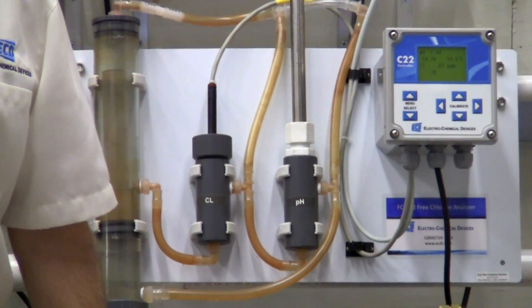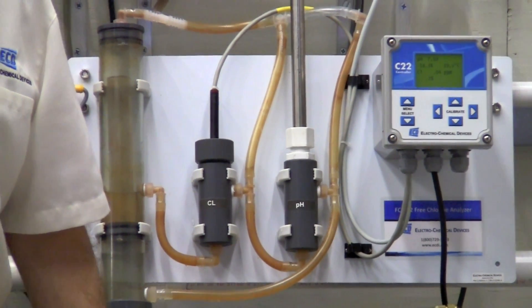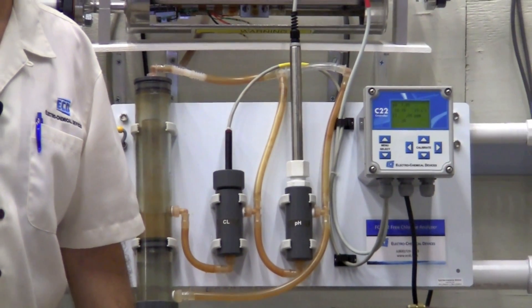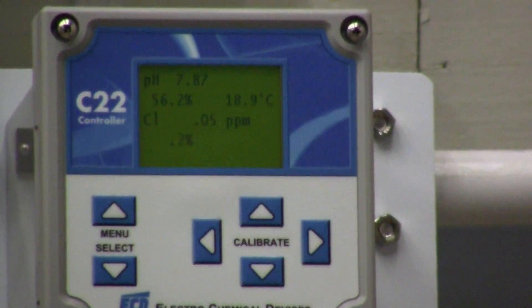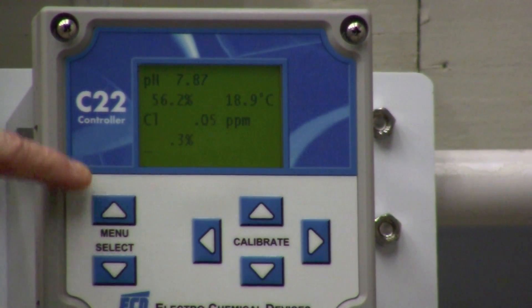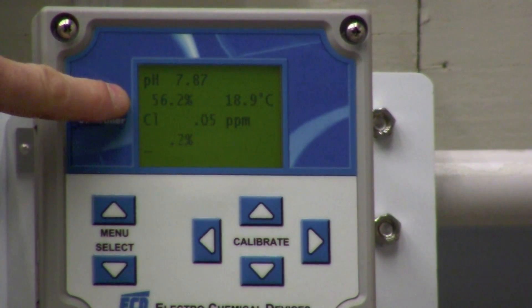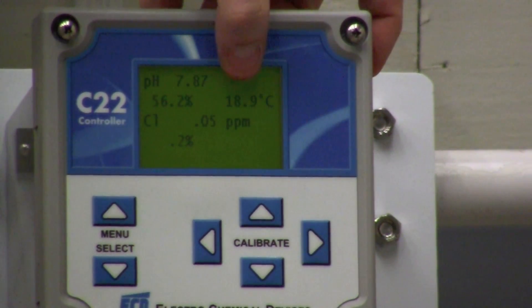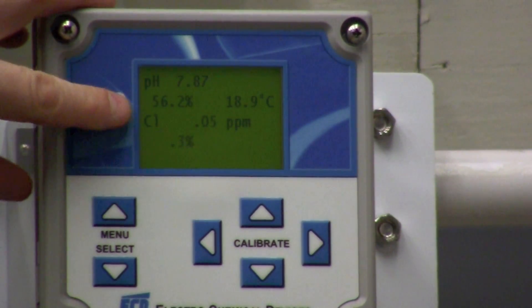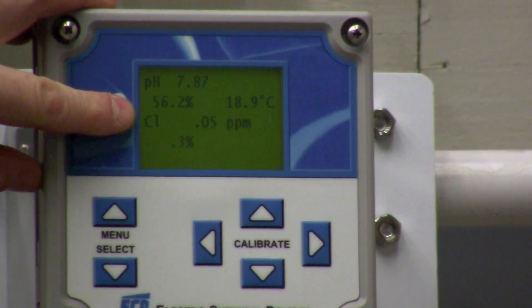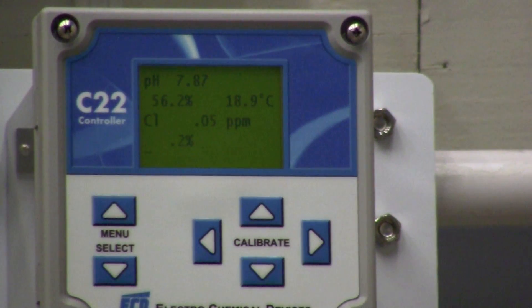The one-year kit for the chlorine sensor cost is one hundred and eighty dollars. Now that we've regenerated the chlorine sensor and the pH sensor, we're looking at a pH of 7.87, 56.2 percent of the 4 to 20 output, 18.9 degrees Celsius, and a chlorine reading of 0.05 parts per million.